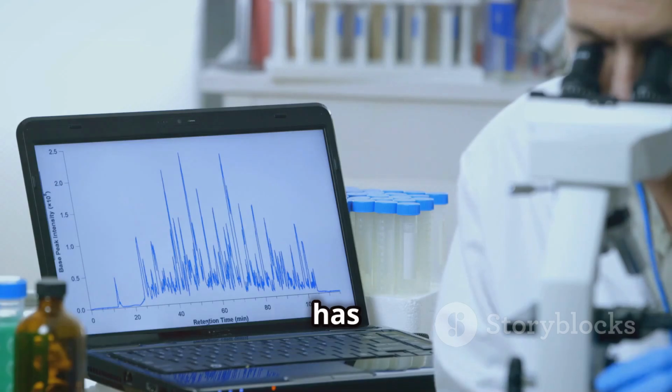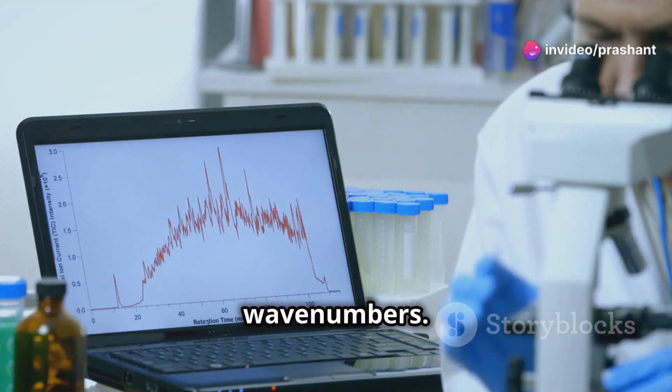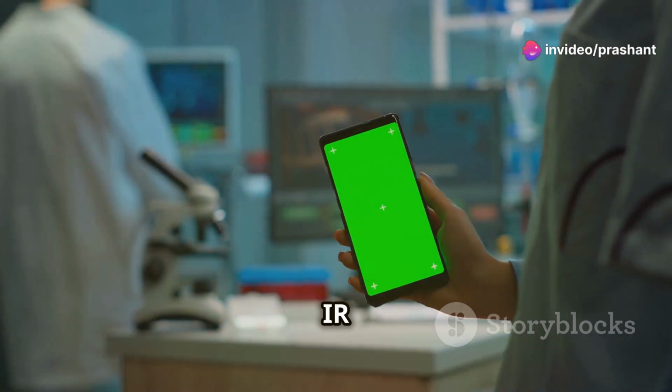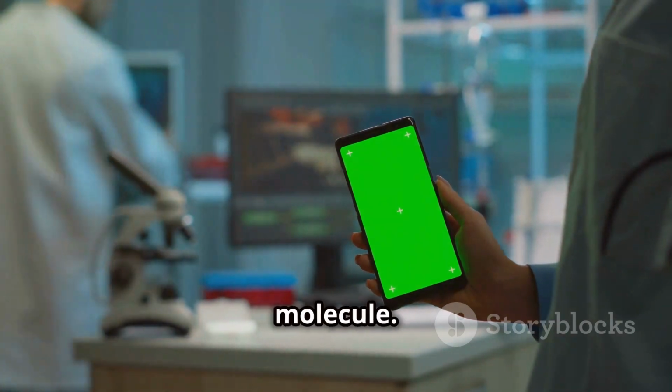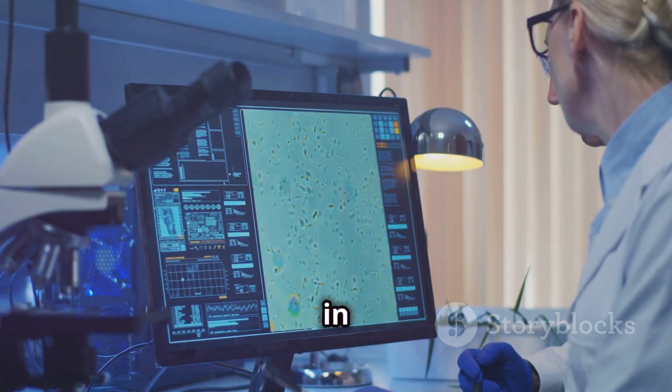Each functional group has a unique set of vibrations that absorb IR light at specific wave numbers. By looking for these characteristic absorption bands in an IR spectrum, we can identify the presence of specific functional groups in a molecule. It's like having a cheat sheet to identify the molecular suspects in our sample.